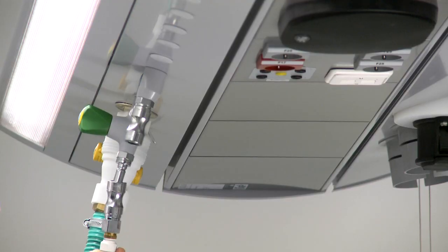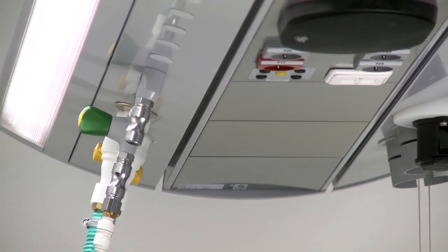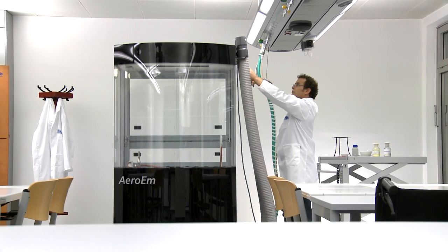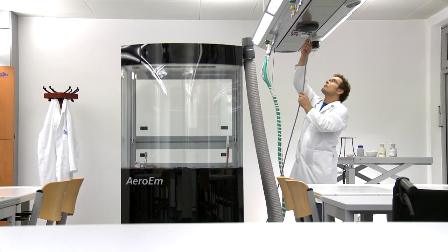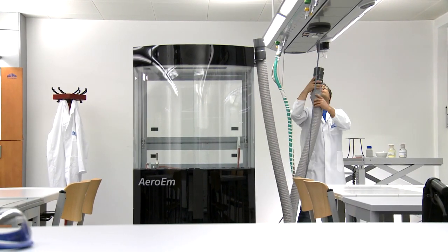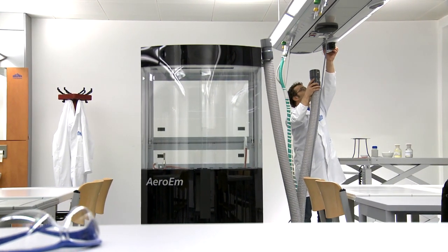Aero EM can be positioned freely in the room and connected to the service wing using plug-in connections. Variant 3 of the service wing offers you the opportunity to operate the mobile fume cupboard in a wide variety of locations in the laboratory.